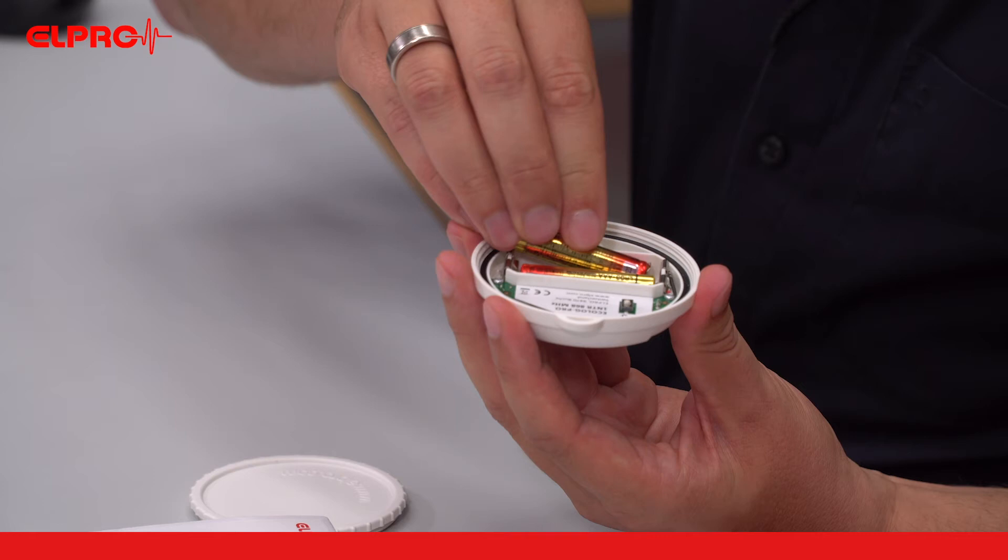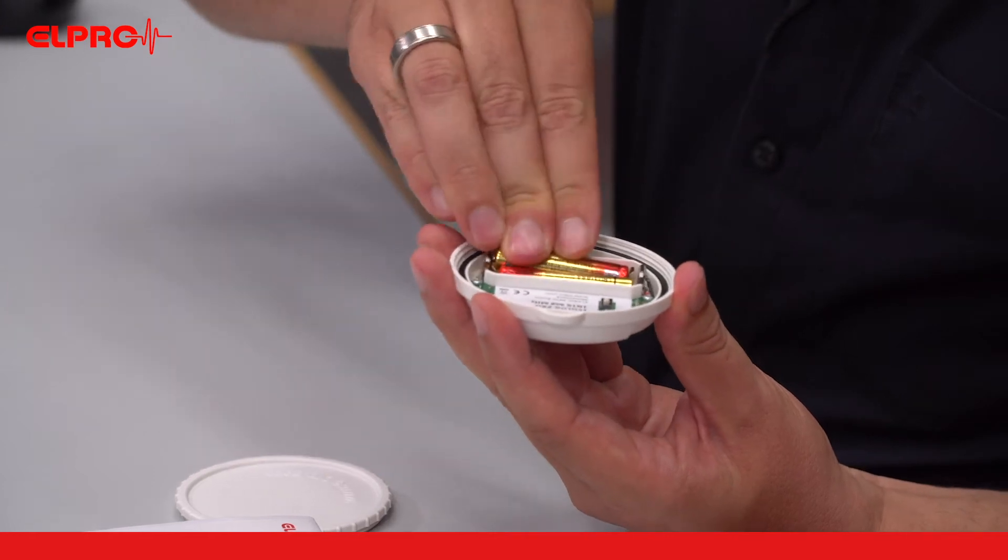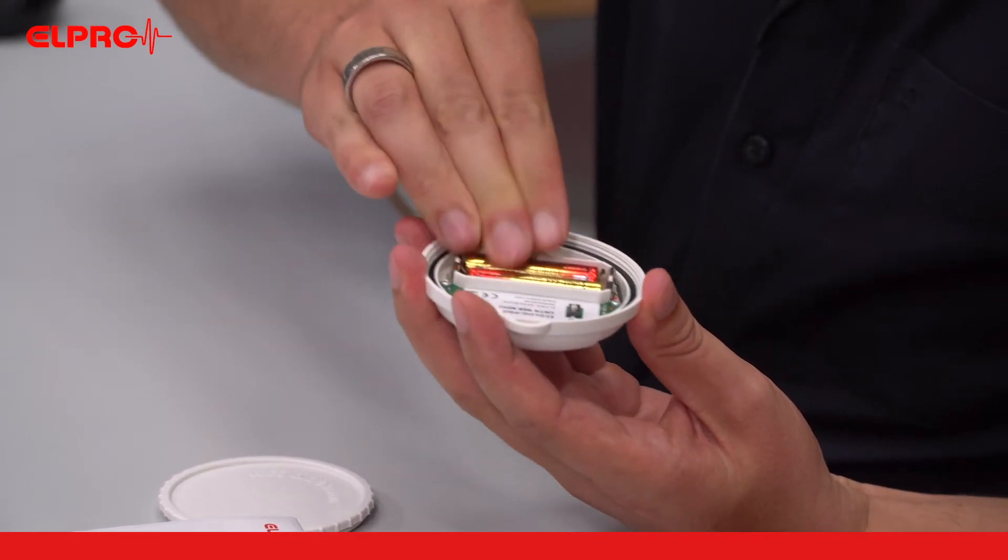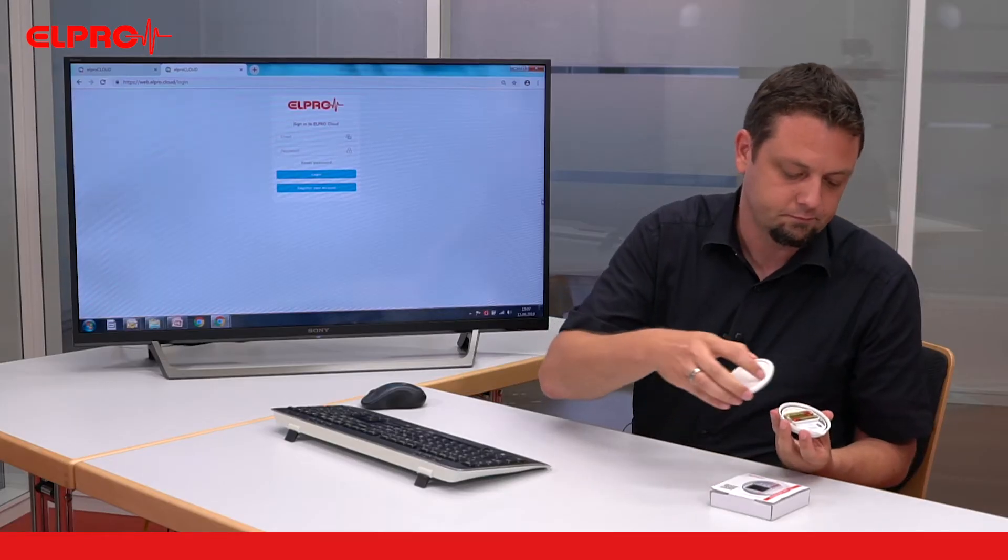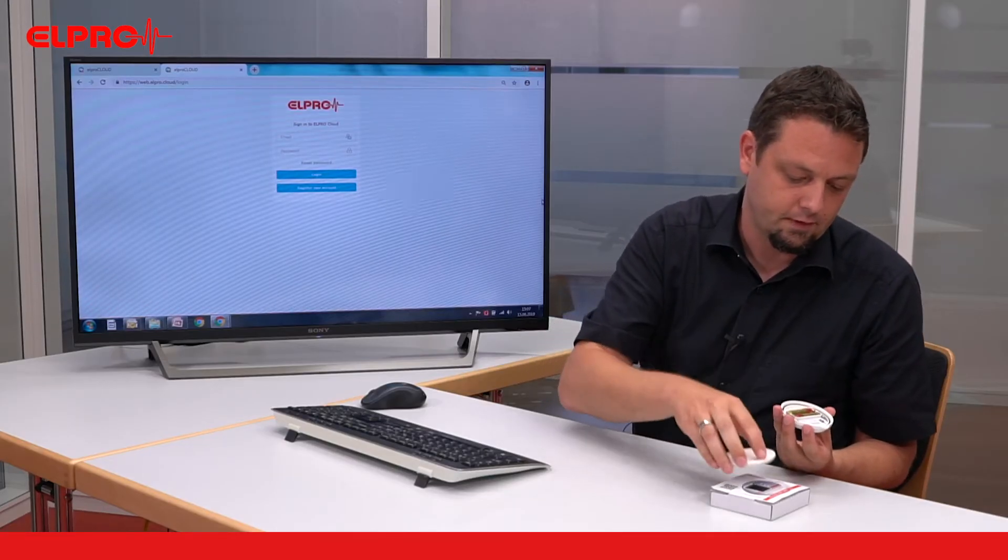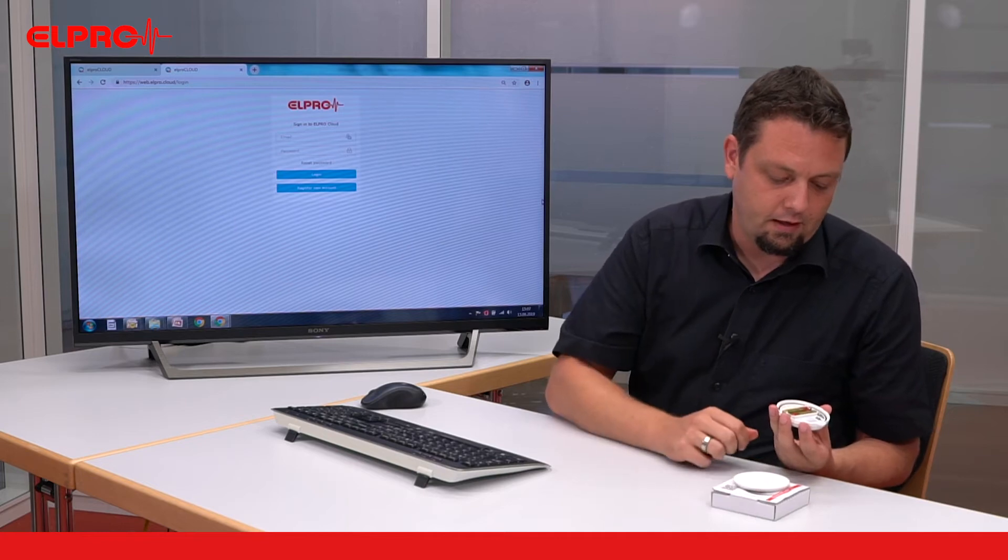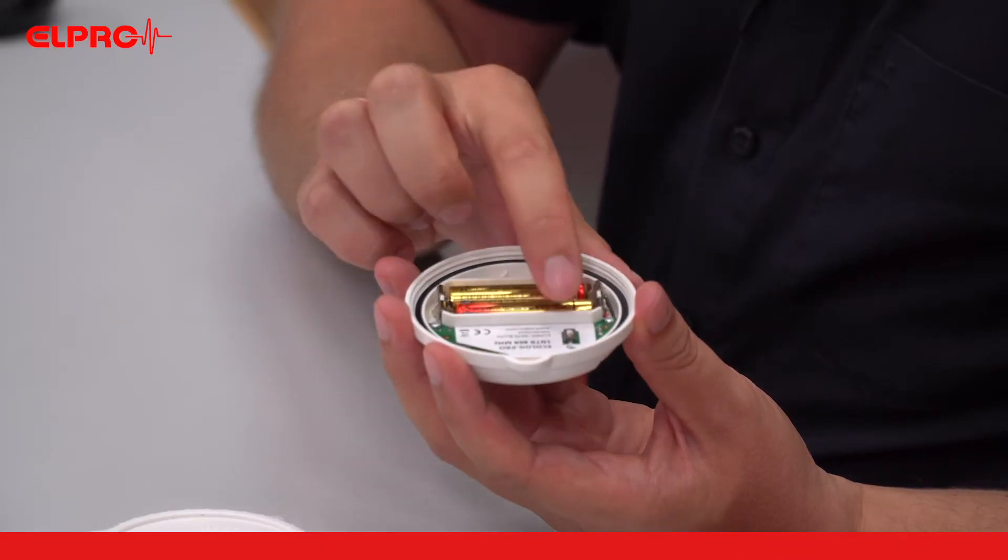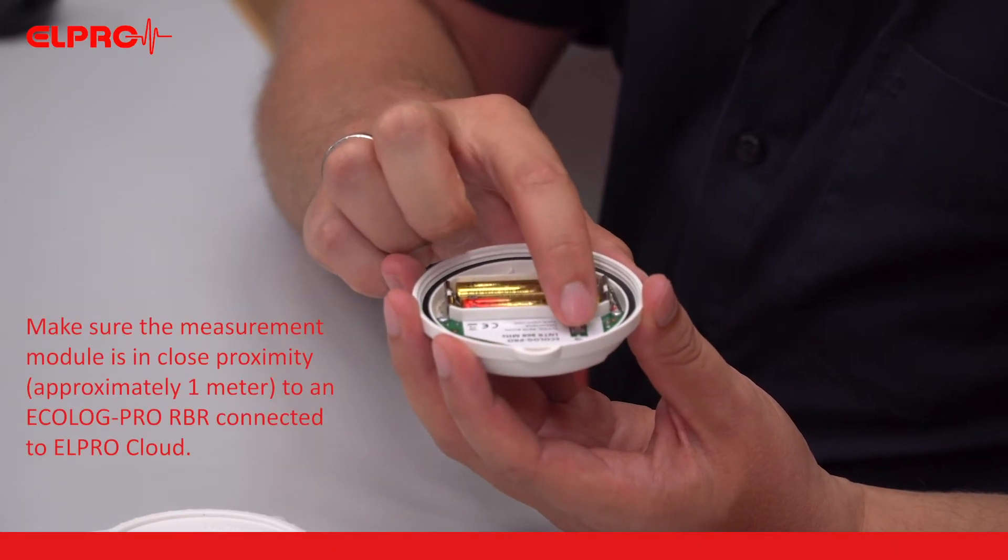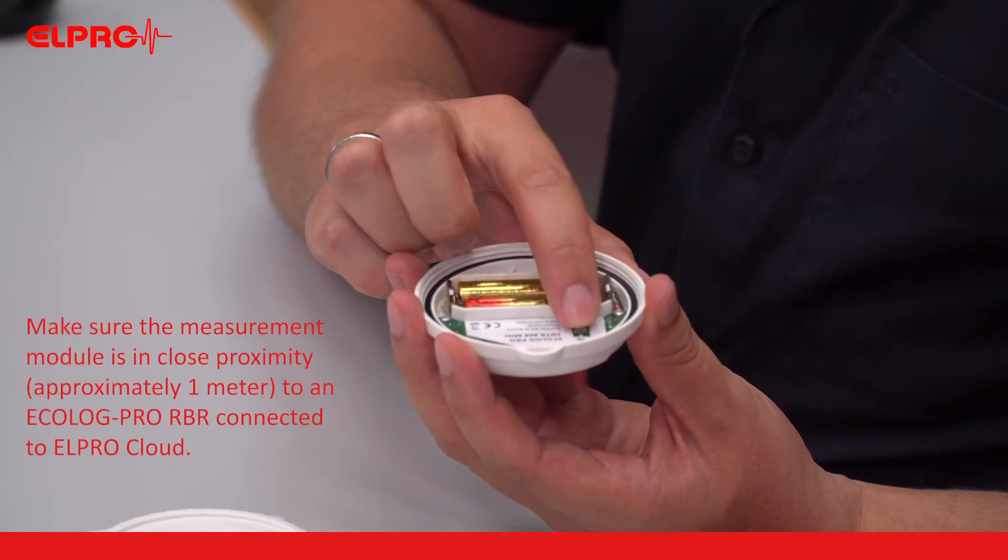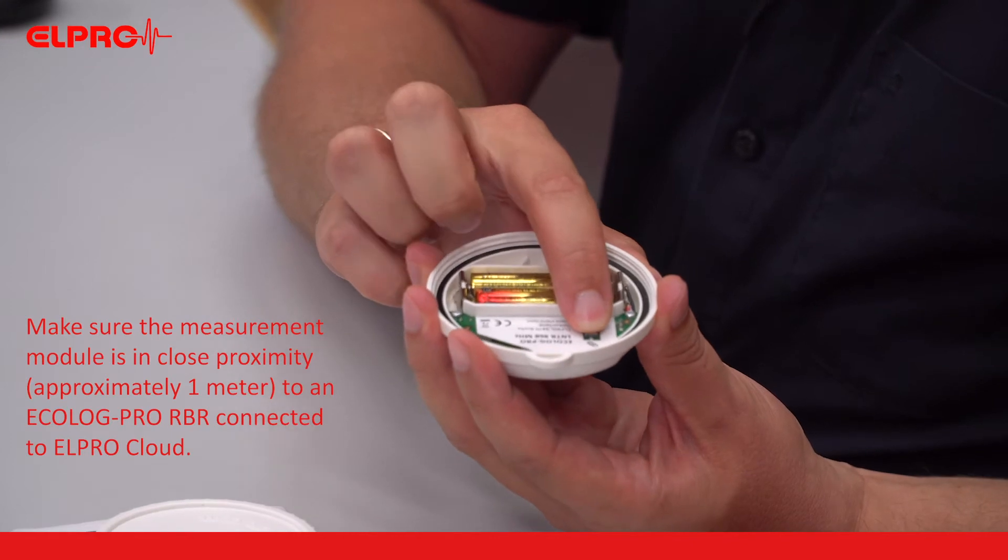The direction is clearly marked in the module. And then we need to press the connect button for three seconds.